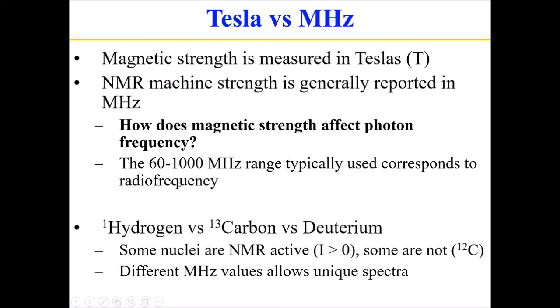It gets very expensive, though, to maintain an instrument that uses a high magnetic field strength. So in the laboratories that we use for student instruction, I think we have a 90 megahertz NMR, which is definitely on the low end, and not really suitable for a lot of detailed experimentation, but it works great for teaching students the techniques of NMR spectroscopy.